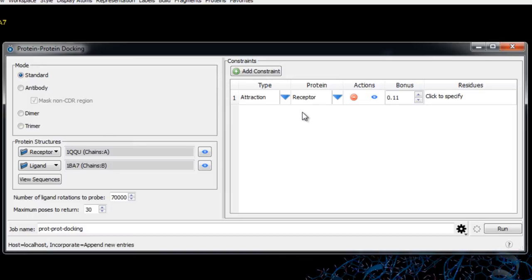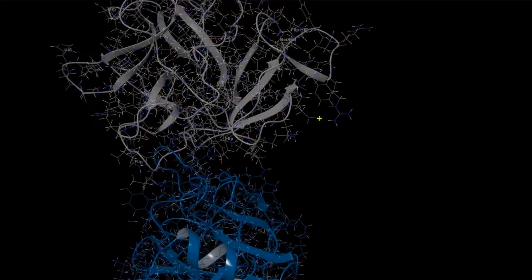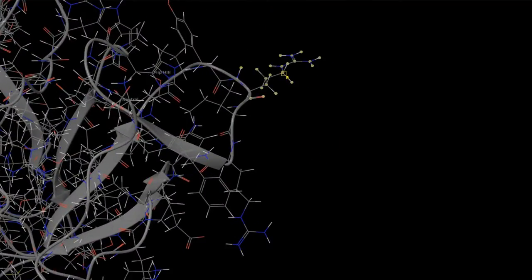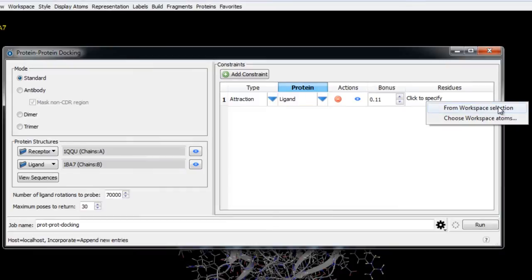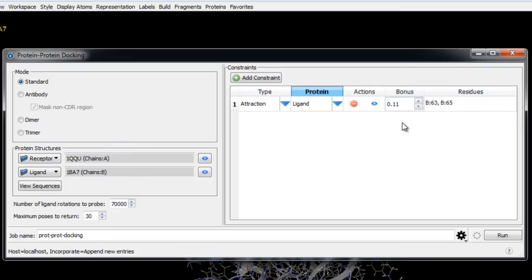For example, let's assume we know in advance that arginine 63 and arginine 65 on 1BA7 bind at the interface of 1QQU. We'll make sure the constraint is set to attraction and protein is set to ligand since 1BA7 is our ligand, then we'll head to the workspace, click R on the keyboard to change the selection mode to residue, and shift-click arginine 63 and arginine 65. We then choose from workspace selection as the residues for the constraint. The bonus value, which must be in the range 0.11 to 0.99, is added to 1 to define a scaling factor for the attractive potential — we'll leave it as the default.